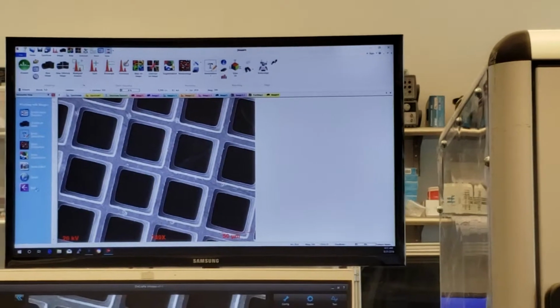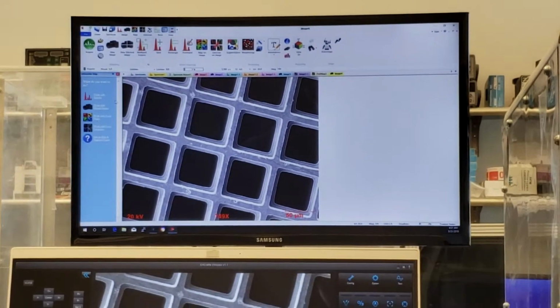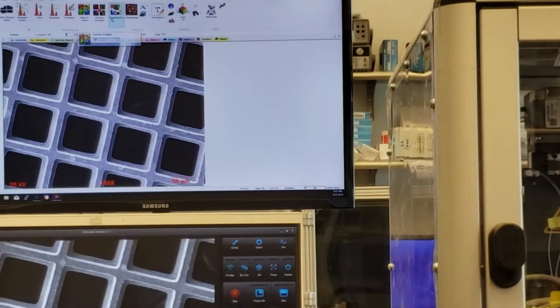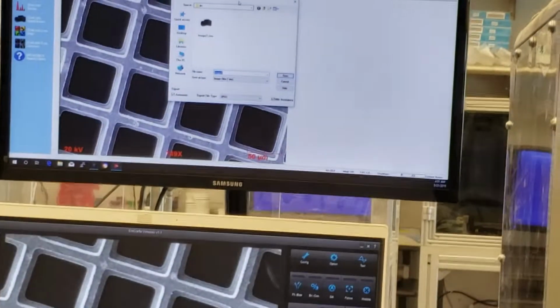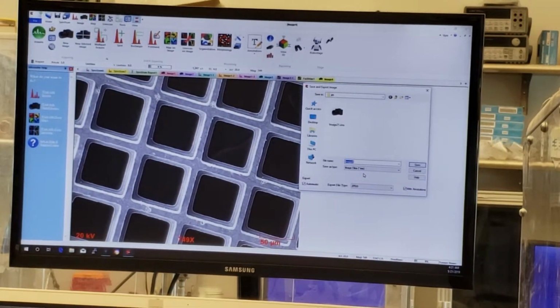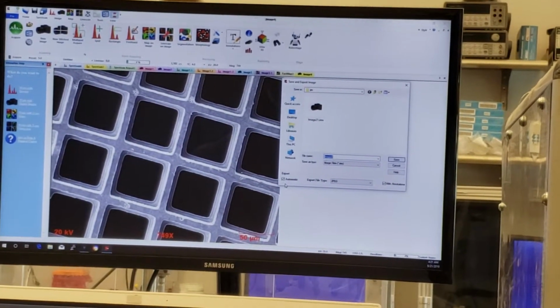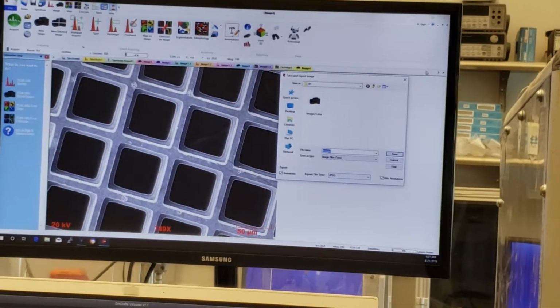So that was like if we use the flow chart. We did the spectra, we did our imaging, and the next one would be mapping. But realistically, we could also go in here, like I didn't go over your file, like Save As, for instance. So this is getting saved, and this holds true in everything. Everything's getting saved as whatever extension it is in our software. Right now, an image is a .imx extension. So it's saving it as a .imx, but it's also automatically shooting it out as a JPEG too. So it's doing 2 saves in 1. That's a really nice feature.